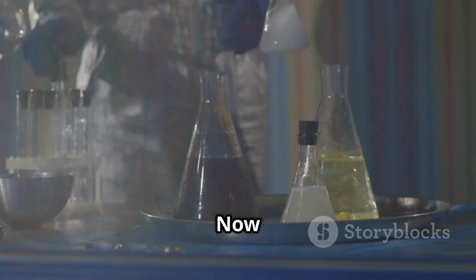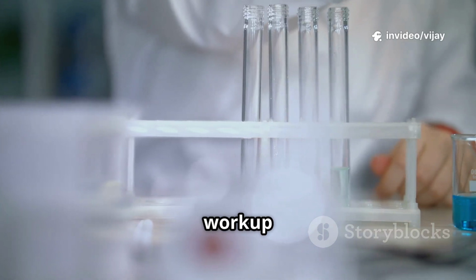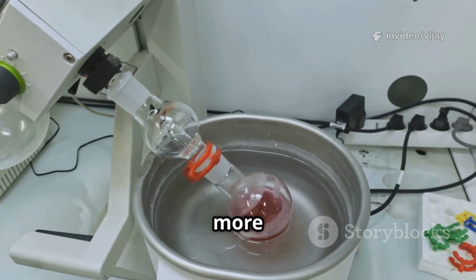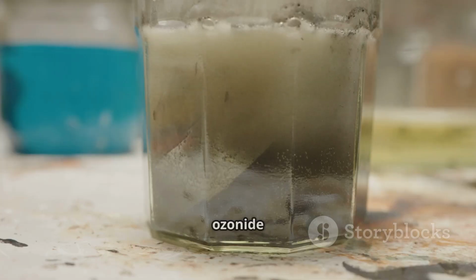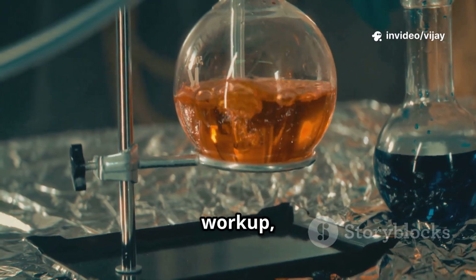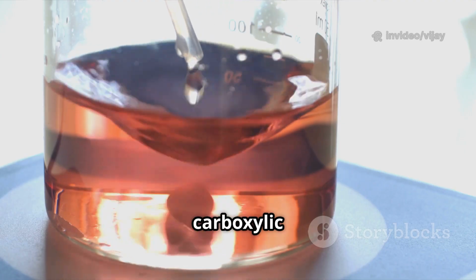Step 3. Now you've got an unstable intermediate called an ozonide, and this is where your workup comes in. You've got two choices. Reductive workup is the more common one. Here, I'd add something like dimethyl sulfide or zinc and acetic acid. This breaks down the ozonide and gives you aldehydes or ketones. For oxidative workup you'd use hydrogen peroxide. This one pushes aldehydes straight onto carboxylic acids.